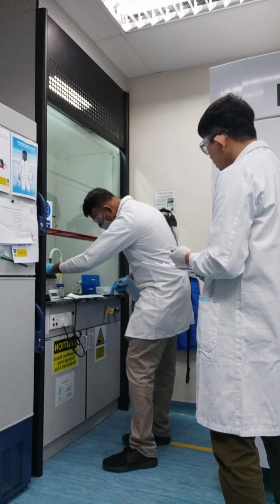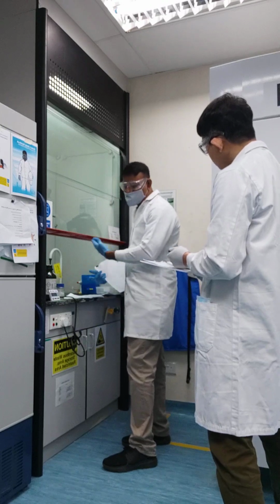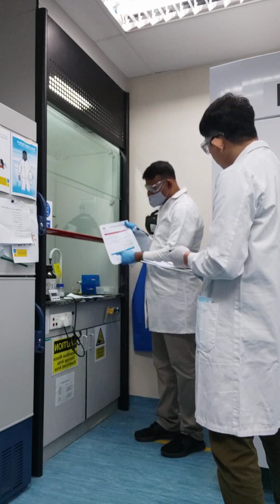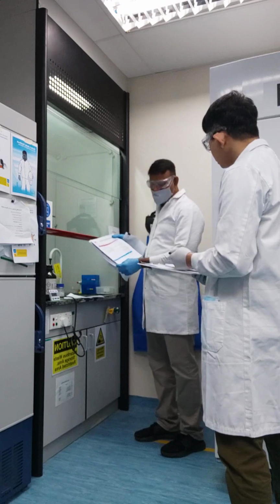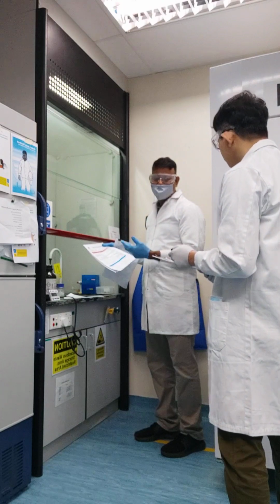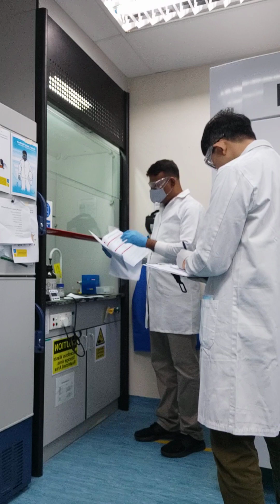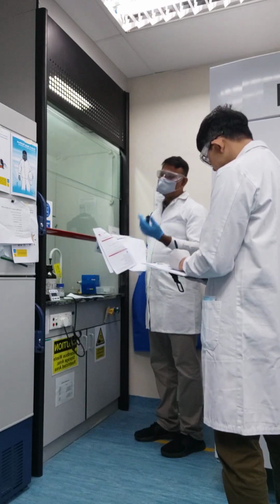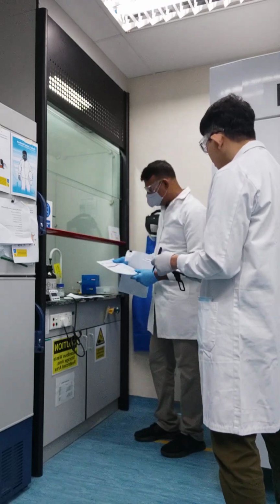The next step is to identify the hazards of this chemical, because we are going to handle it. For that we need the safety data sheet. The safety data sheet is the document given by the chemical supplier that gives you all the hazard information, exposure information, and how to handle it: the precautions you need to take and how to use the personal protective equipment appropriately before you handle the chemical.